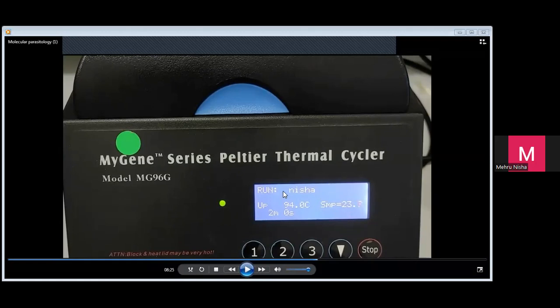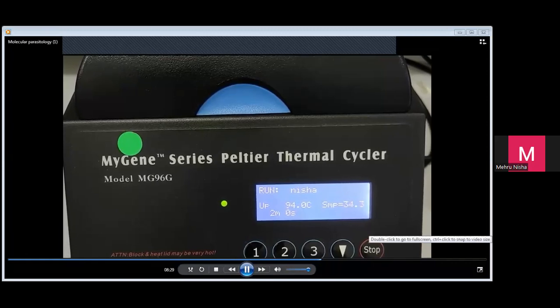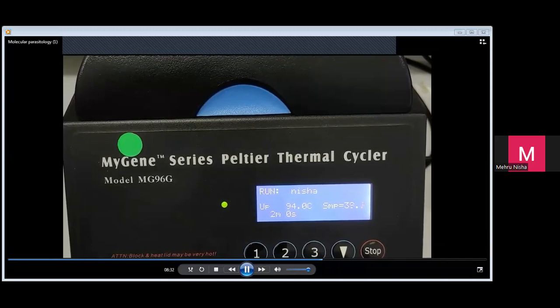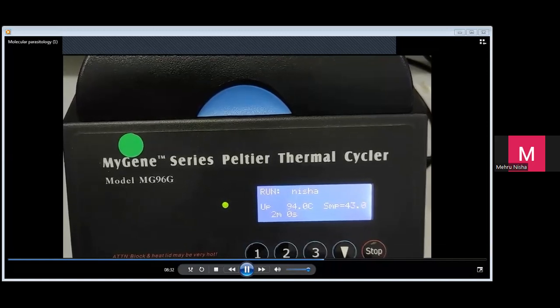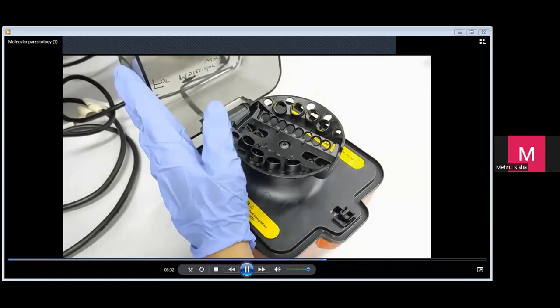Like for me, I have my students have it under my name. So the initial temperature that we use is actually at 94 degrees. Then it will run, depends on which PCR machine you're using. We set at 30 cycles. So this PCR will take around 3 hours. Like sometime 1 hour also can. Tengok berapa size amplicon yang kita perlukan.